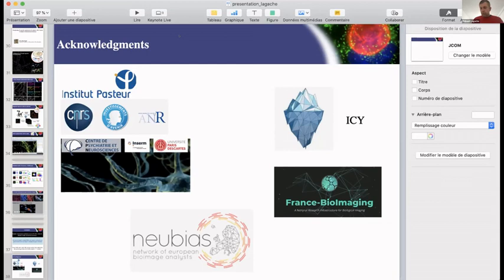And you even have a column where you specify the number of photons, and you can specify that you just want to use the localizations with more than a given number of photons. So this is a series of blocks that is really going to specify the columns of your Excel file for the localization. Hope I'm clear.